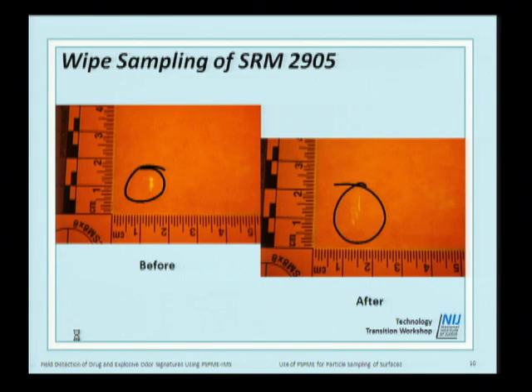We're going to try to visualize these in the laboratory. Normally, you want to do this under dark lighting conditions. Now, this is not something that you do in the field as a trace detector exercise. We want to do this to illustrate the steps in capabilities for collecting particles.